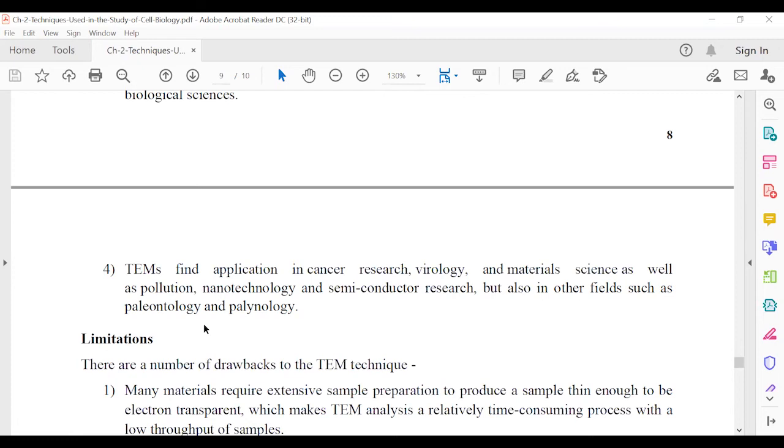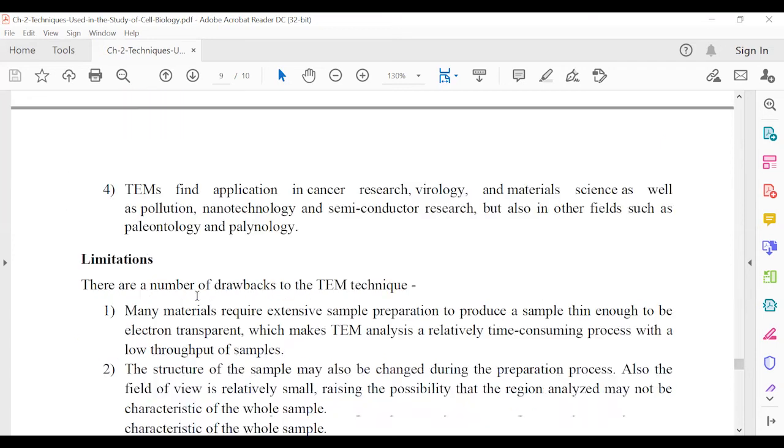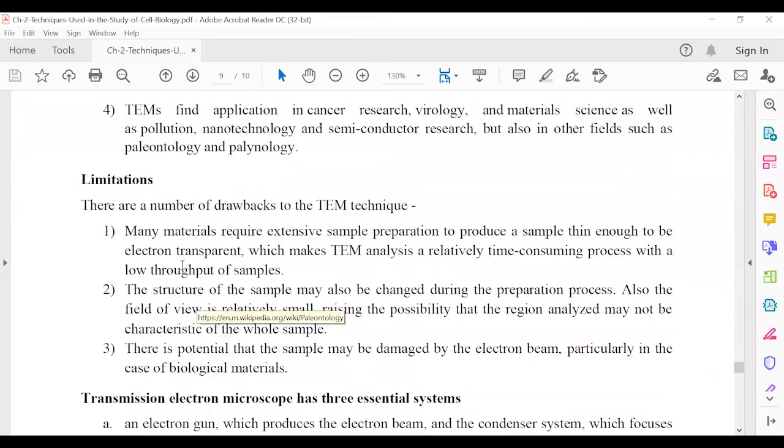Some paleontological object identification, and also determining the age of the particle. This type of microscope is generally used for scanning and imaging.